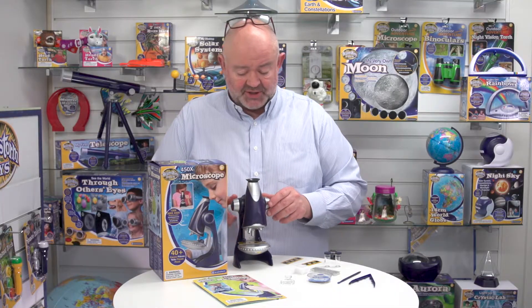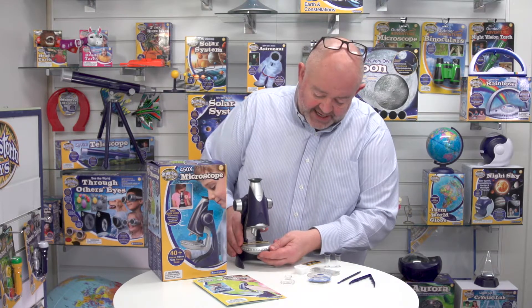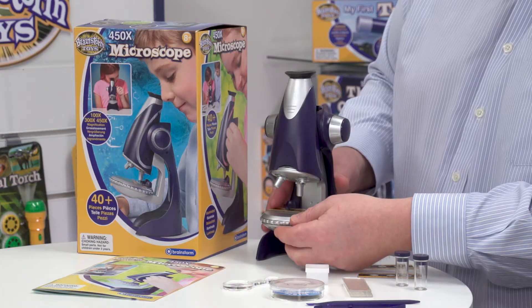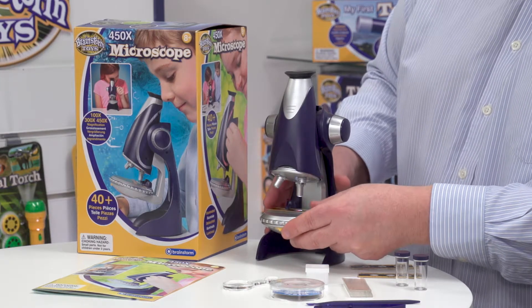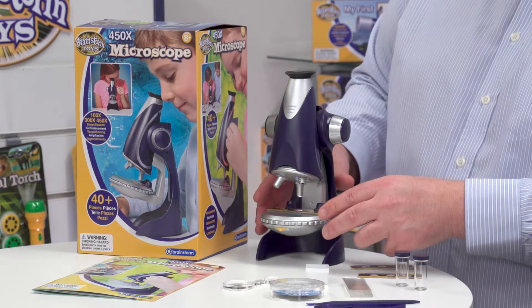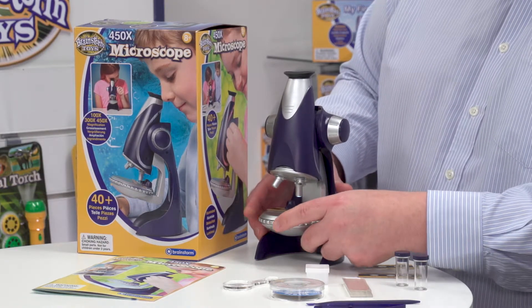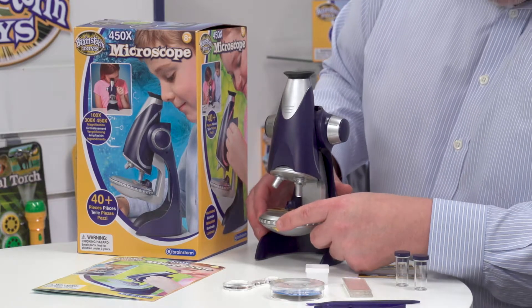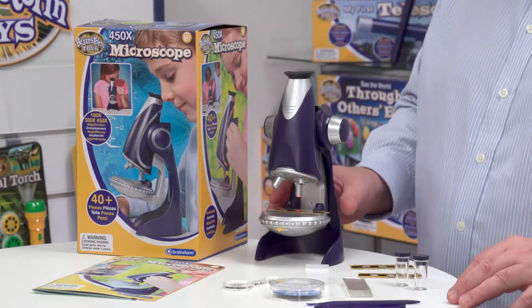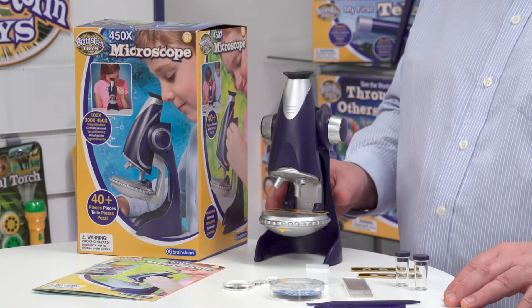Getting back to the microscope itself, it's nice and sturdy and steady. At the front there's the stage where you put the sample, which locks in under these two little widgets. There's a little button that switches on and activates the light. The good thing about this microscope is that the light can change — if you rotate the stage it goes from clear to blue to yellow and then red, so that kids can look at samples under different light sources as they react in different ways.